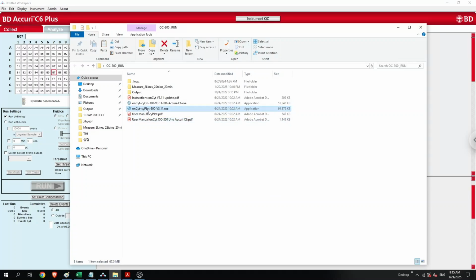Okay, so this is for data processing. Open this. This is simple, so no worry.